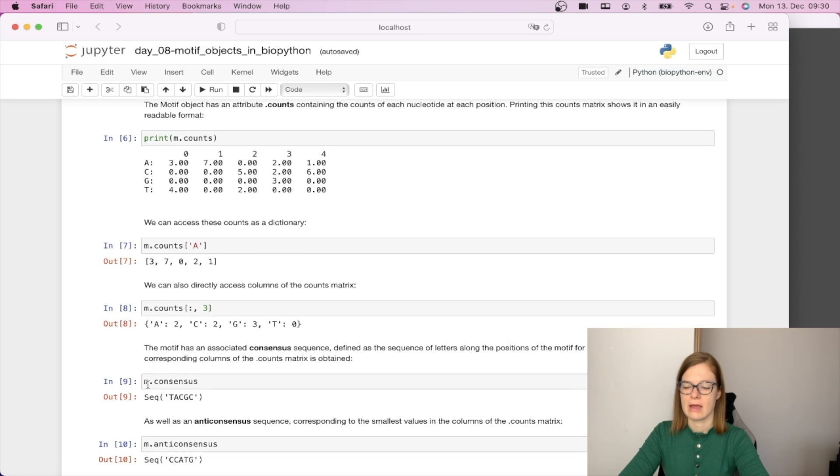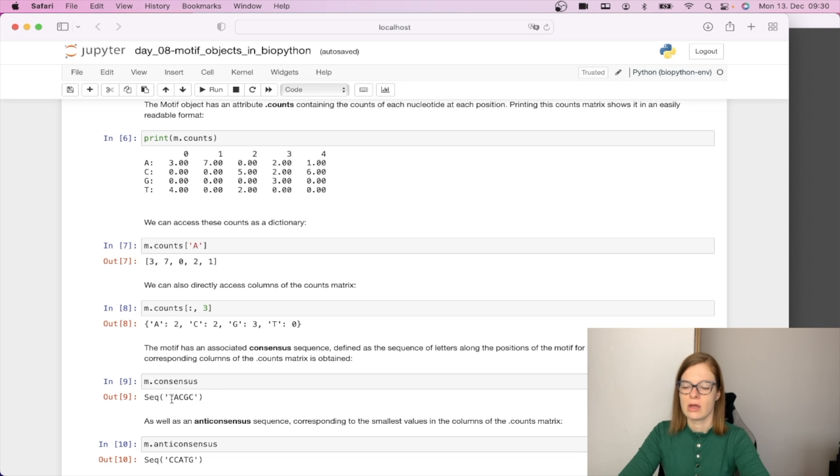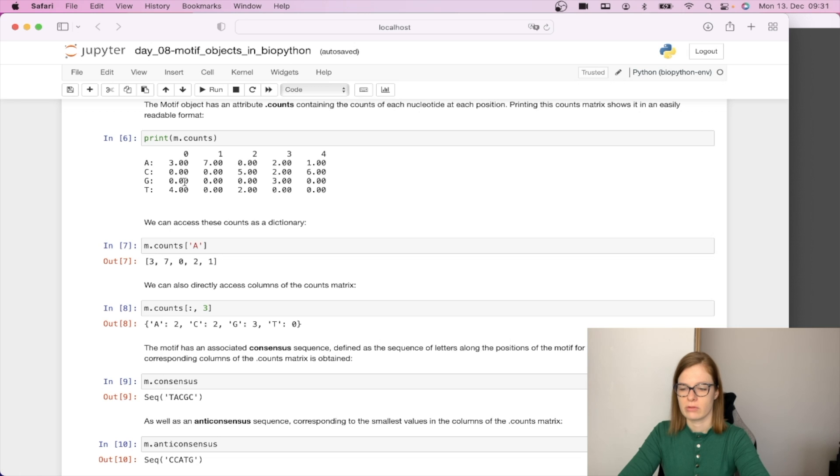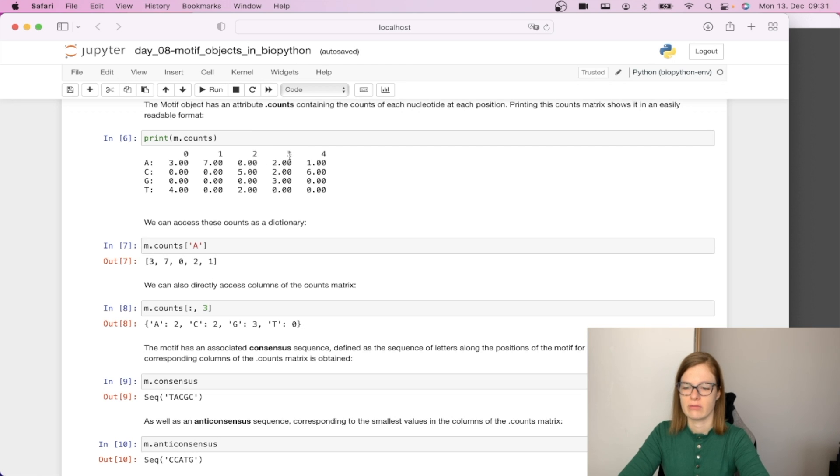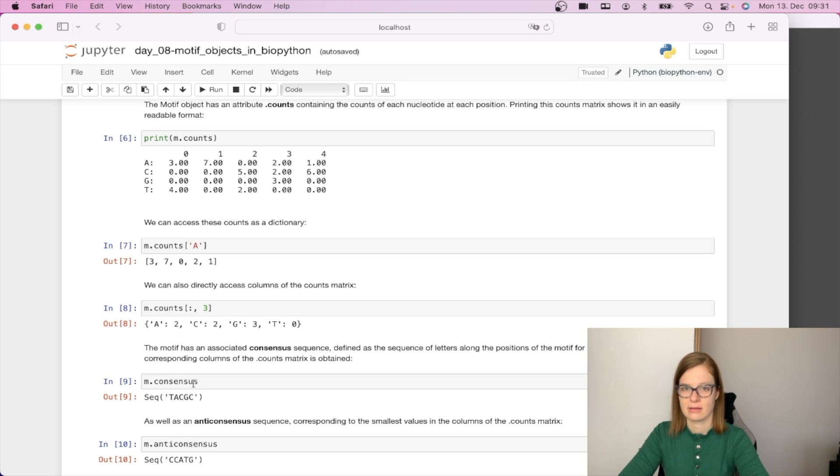By saying m.consensus we get the consensus sequence and this will give us back per position the nucleotide with the highest frequency of occurrences. We see for position one we get T, for position two we get A, position three we get C, position four we get G, and position five we get C and this is exactly our consensus sequence.